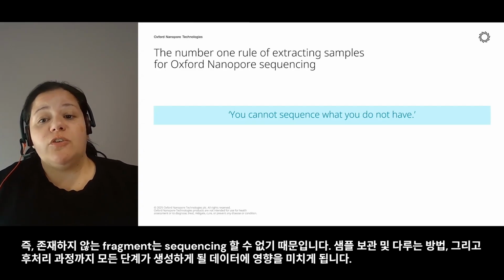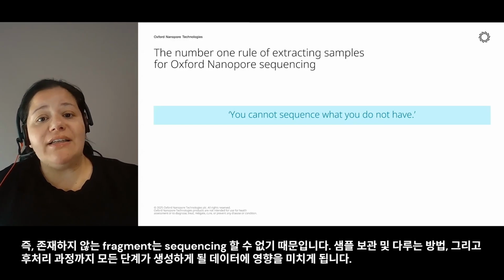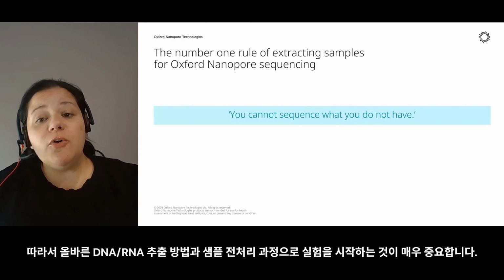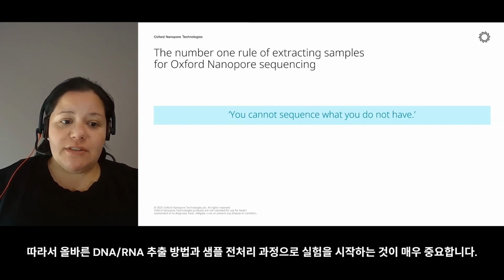Everything from sample storage and handling to extraction and manipulation will have an impact on the data you are going to generate. So it's important to start your experiment with the right extraction and sample processing.